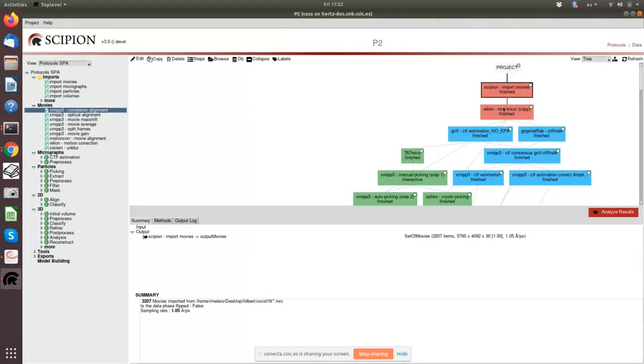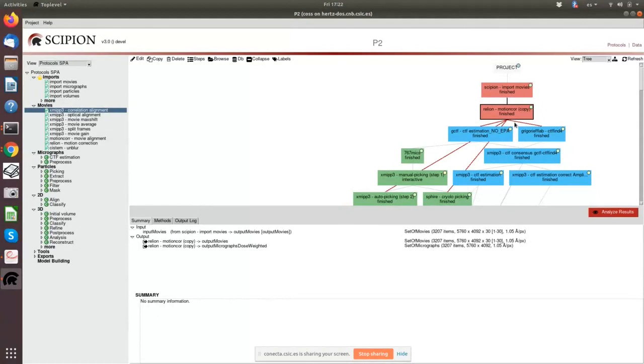Okay, so you do your motion alignment. In this example, I used only one algorithm because we don't have the trajectory comparison yet. The one that you use also makes a difference, in the sense that if at the end of your process you want to do polishing, most polishing programs assume that you have done the motion correction with one particular program.